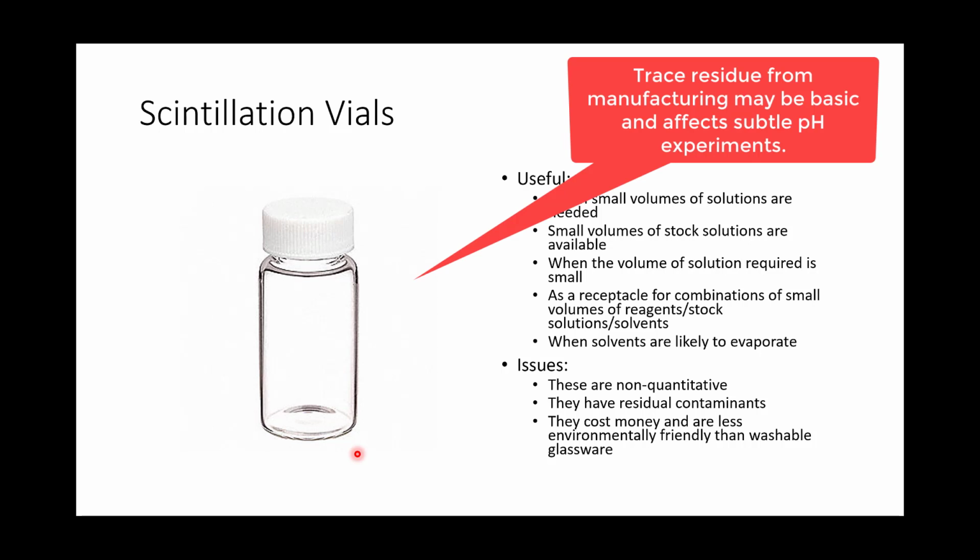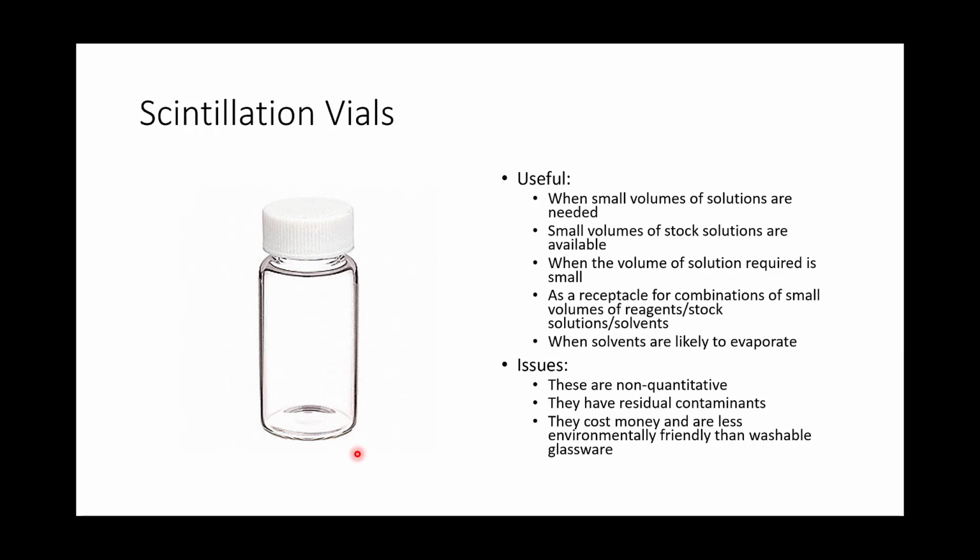And also these scintillation vials, even though they're consumables, we must recognize that they cost money to buy, and also if we're using plastic lids, we want to reduce the amount of plastic that we use as much as possible. So be thoughtful about what you use. These certainly work very well in some experiments, but of course we also must consider our carbon footprint, and that's an important factor when we're considering chemistry in the 21st century.